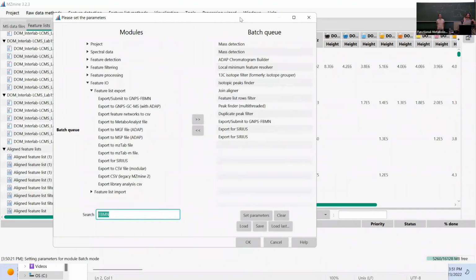So then you can start fresh from my batch. But also some of the data sets might have higher noise levels, and we didn't really optimize for every data set now, but that's also going to be one result, that maybe the instrument that they use has a higher noise level, or there's some other contaminants in the data, so it might be more complex.